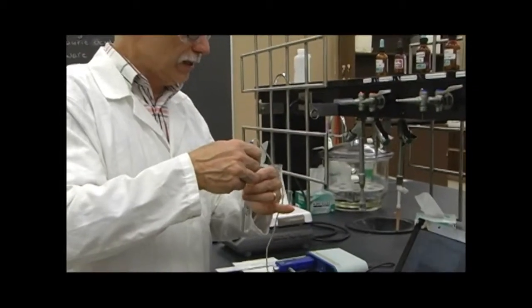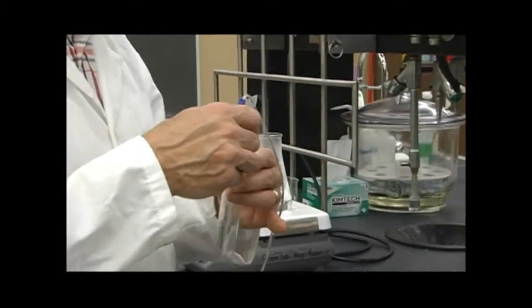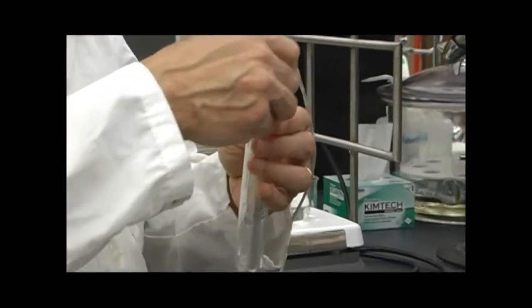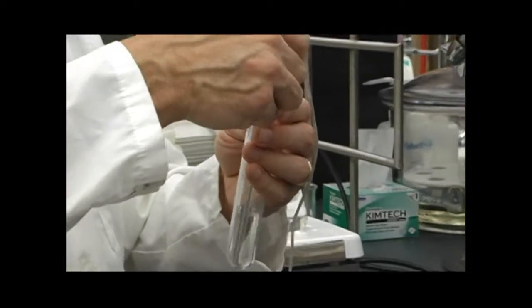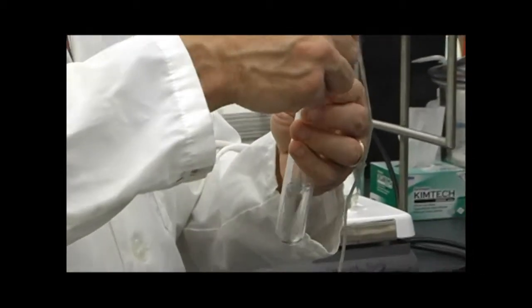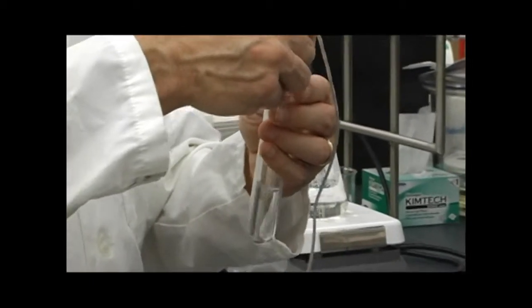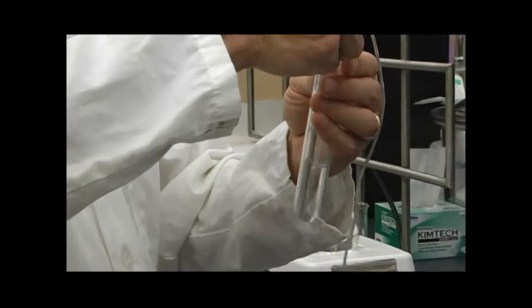So we're just approaching the freezing point of the lauric acid. We'll just keep stirring and we'll try to notice the slush point. So, looks like the science is coming true.